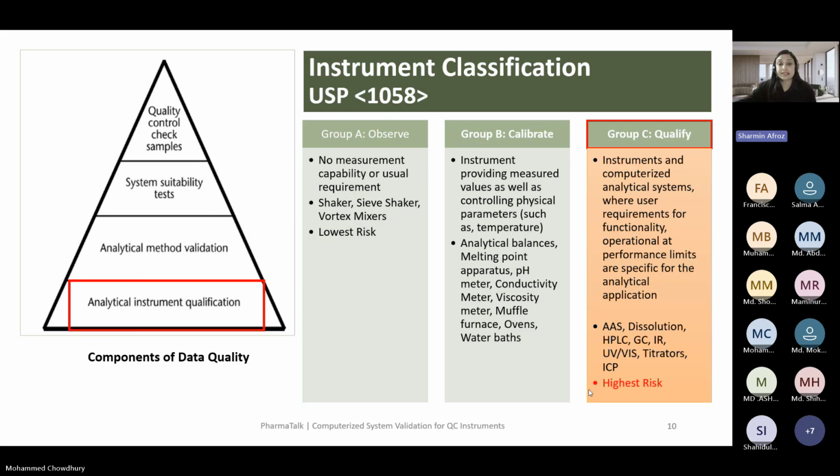I think it's like the Excel sheet validation, and you have to validate your script and what you got from the calculations, and challenge the calculation, and you have to document it. You don't need to validate the user access, and it will be performance based, I think, because from what I understand, it is like the Excel system based.